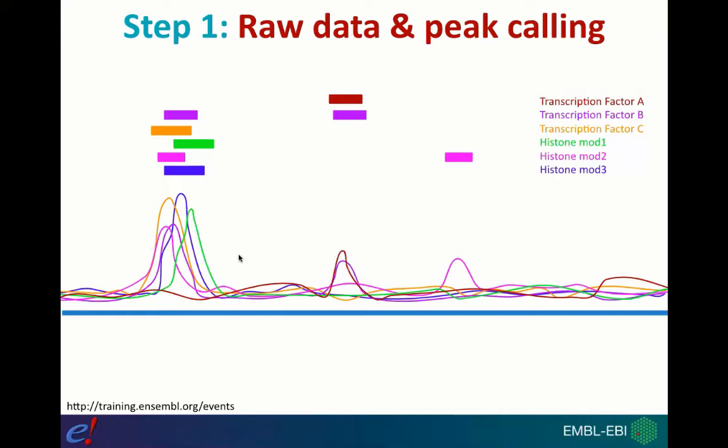And we can do the same all along the genome. You can see here this pink block comes from this increased signal. And then we have this actual grouping of peaks that all correspond to signals that have increased in this region of the genome. What we then do is we look to see whether there are different patterns of signals and peaks that all correspond to a single region within the genome. Like you can see here, there's a cluster of peaks all in the same region.